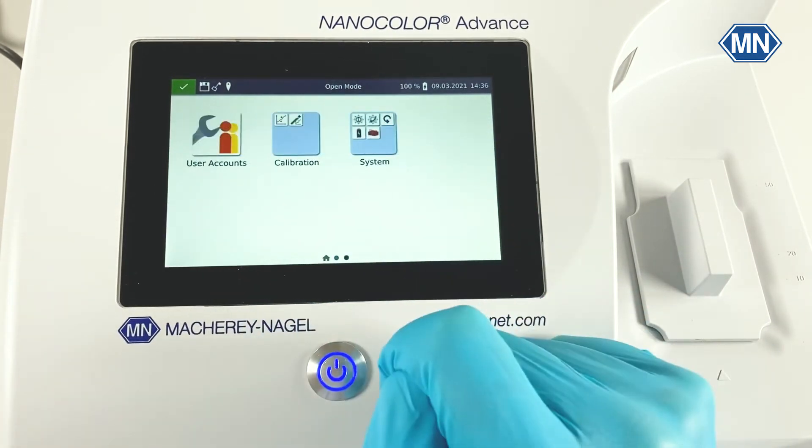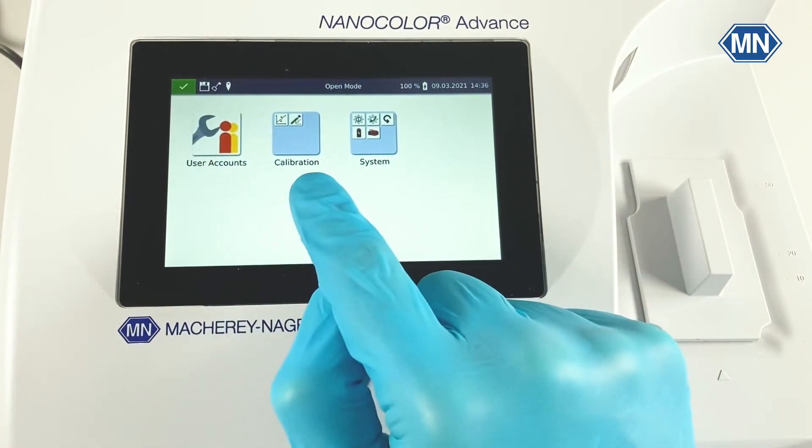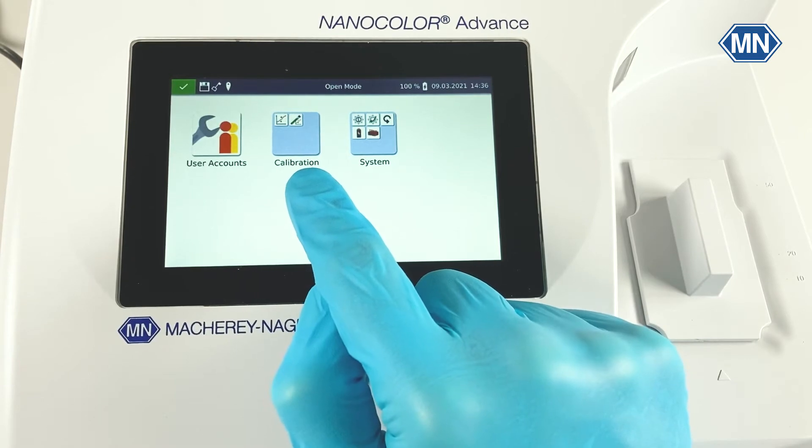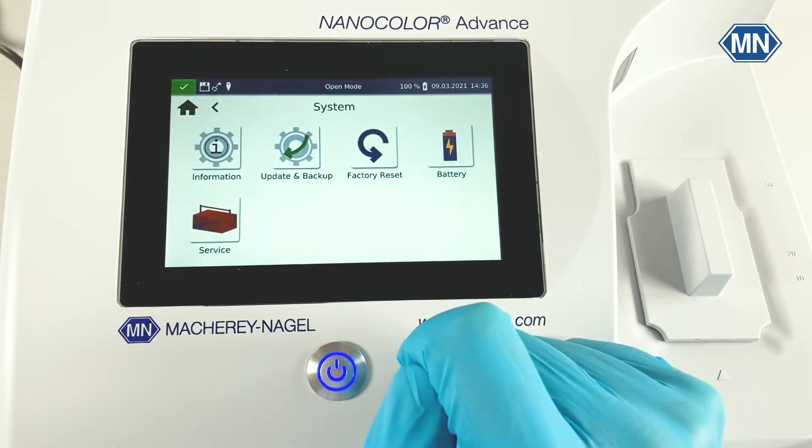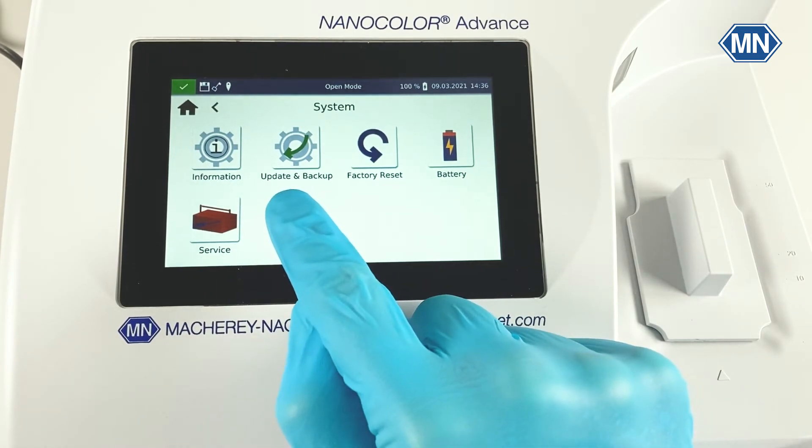On a third page, you can find the user account management as well as the calibration function from which you can calibrate the photometer yourself. It also contains the system menu from which you can update and backup the device as well as restore it to factory settings.